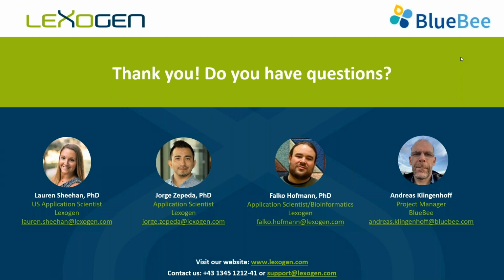Thank you, Jorge. Is there a limit to how many replicates or treatment conditions within a single experiment can be analyzed for differential expression using your interface? So I take this one. Generally, the differential gene expression testing is done by DESeq, and this is done pairwise. There's no clear limit on how much you can input as one group or the other, but at the moment we only support pairwise testing. If you want to do more complex analysis, for example likelihood ratio testing with DESeq, where you have different treatments and time series, this is currently not yet available.